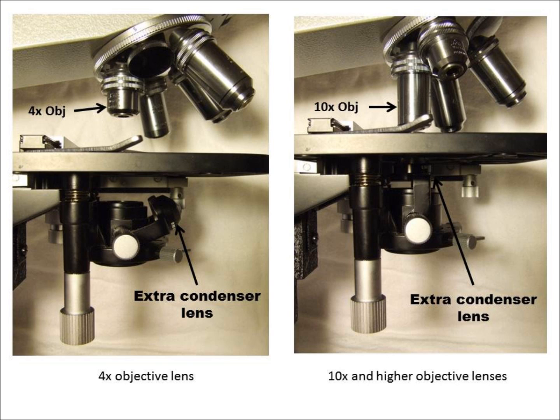I recommend that you examine the periphery of the tissue first and then the center. Finally, after you locate something interesting, switch to the 40x objective lens. In general, the focus at 40x should be close to that of the 10x objective lens. However, you may need to adjust the condenser diaphragm.